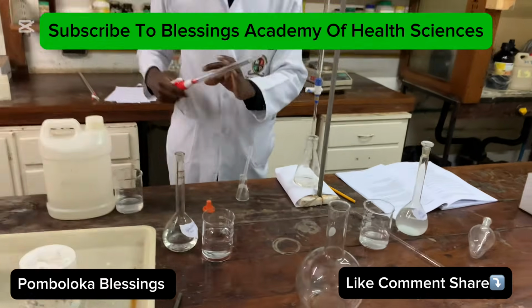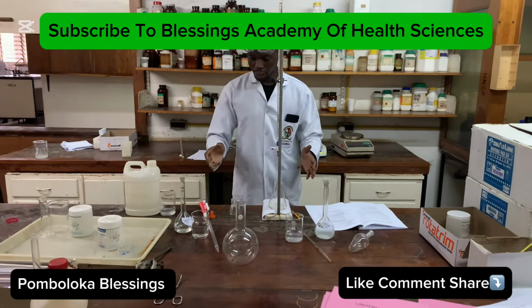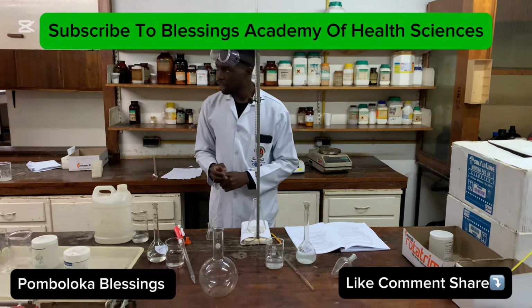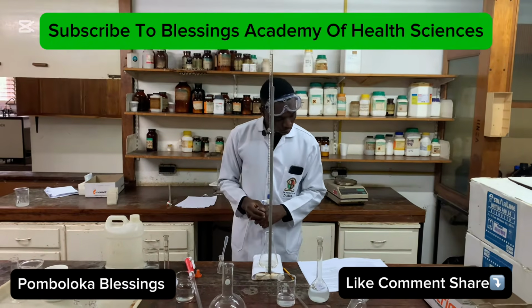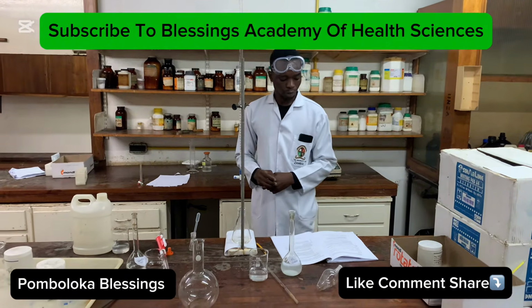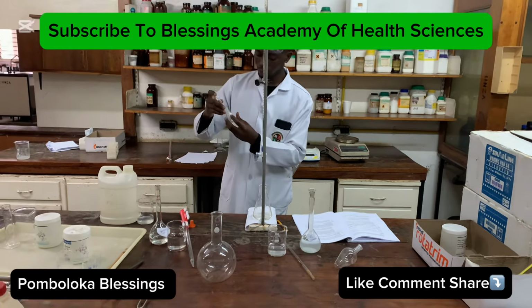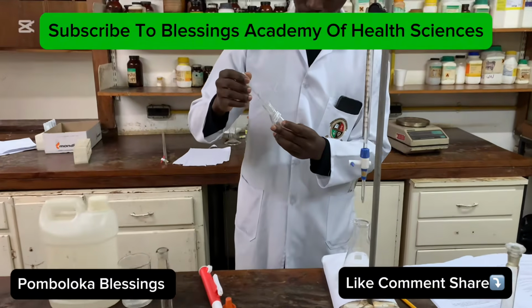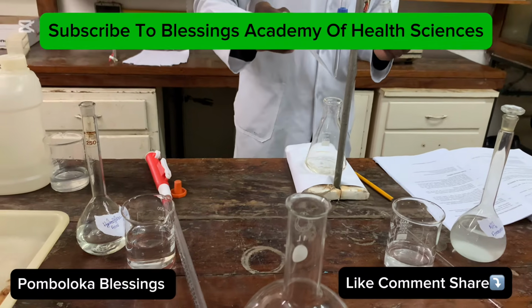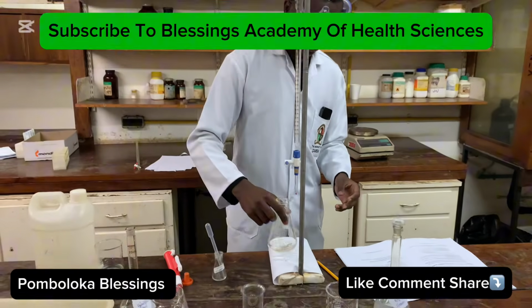All right, mixed. So remember, 5 cubic centimeters of the ammonia has been mixed with 25 milliliters of the hydrochloric acid. So now the second part of the procedure is telling us we're supposed to add 2 to 3 drops of the phenolphthalein indicator. And the phenolphthalein indicator is here. We have it, and we're adding 2 to 3 drops. 1, 2, 3. We've added the indicator. And then we're supposed to mix.